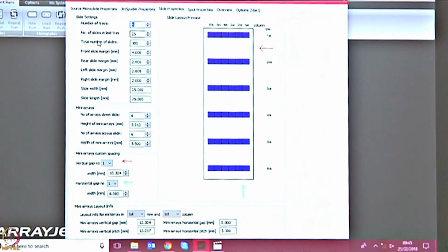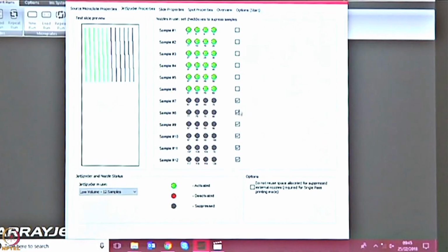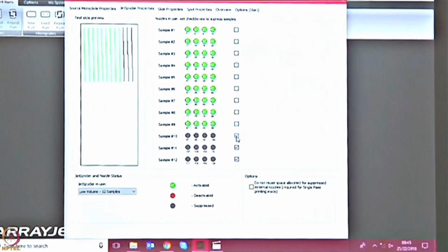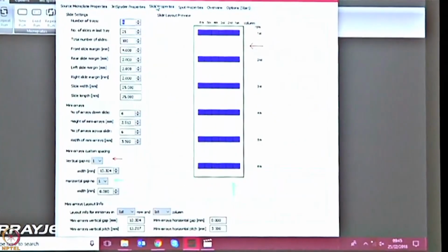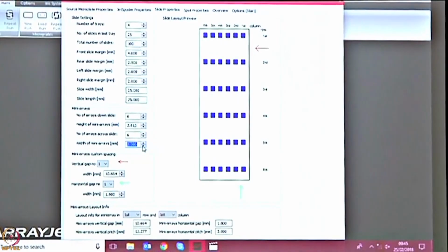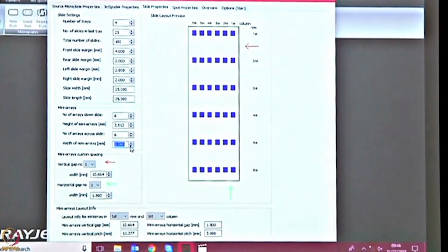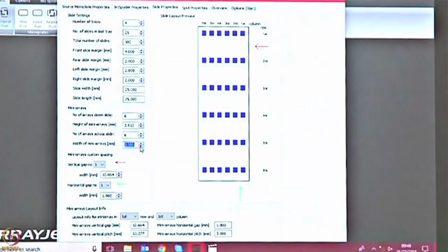And right now, because we have many samples and we have such a small area, it cannot fit all these samples. Let me go back to the basic. You said 22, so let's stick to 22. So that's my 11, and now I can, from one slide, let that be a blank slide, but from my blank slide I have made many identical assays. Each assay contains 22 samples.